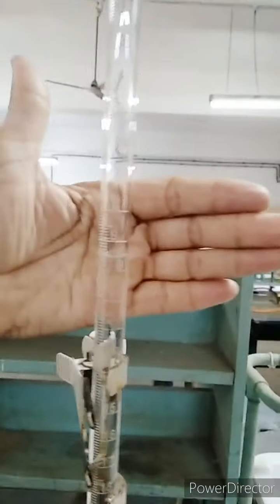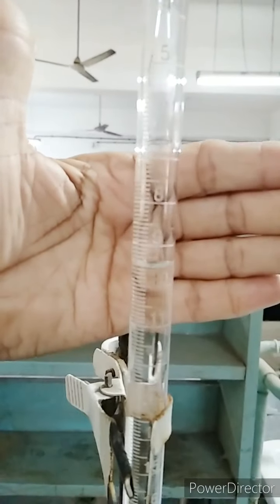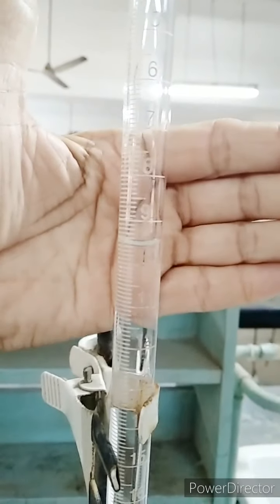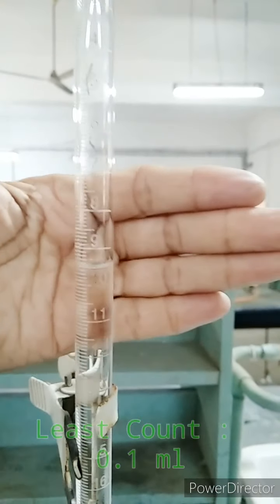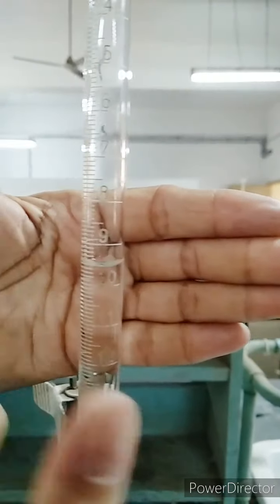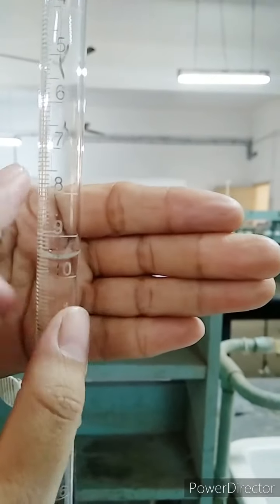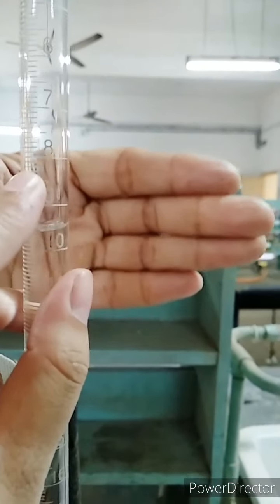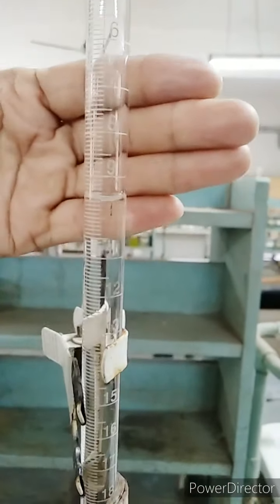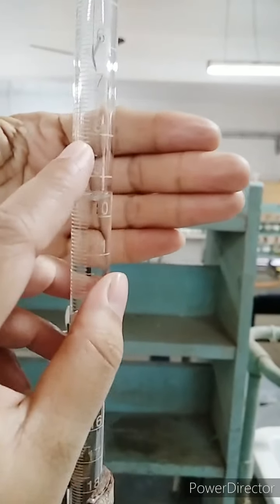Now we'll note the reading. We will see that the reading is 9.6. That day we talked about the least count of our burette. The least count of our burette is 0.1 because between our two readings the difference is 1 ml, and in 1 ml we have a graduation of 0.1 in each level. 1 ml is divided into 10 divisions. So the least count of one graduation level is 0.1. So 9.6 is our final reading.